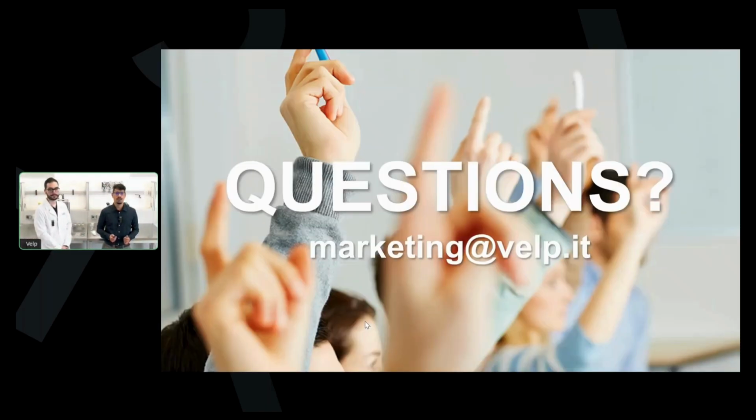So let's see some of the questions that we collected. The first one, Vittorio, is how can I choose the correct type of solvent? Thank you for the question. The correct type of solvent can be chosen on the basis of the analysis that we have to perform.